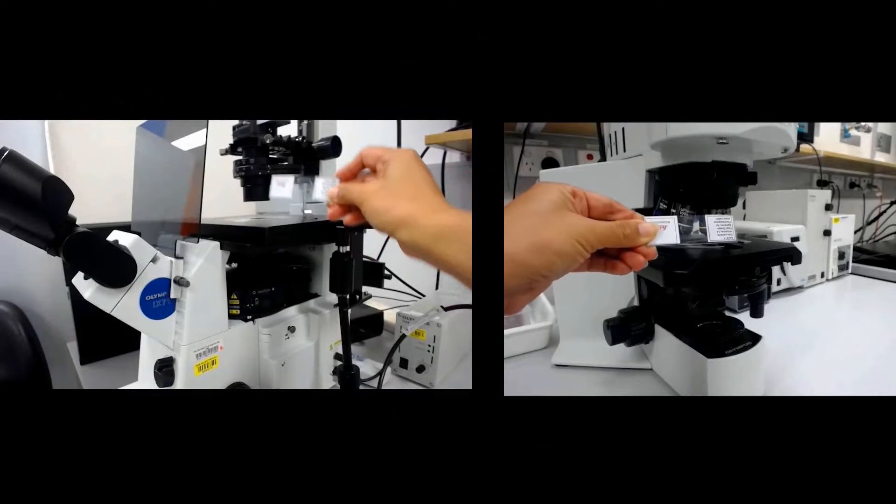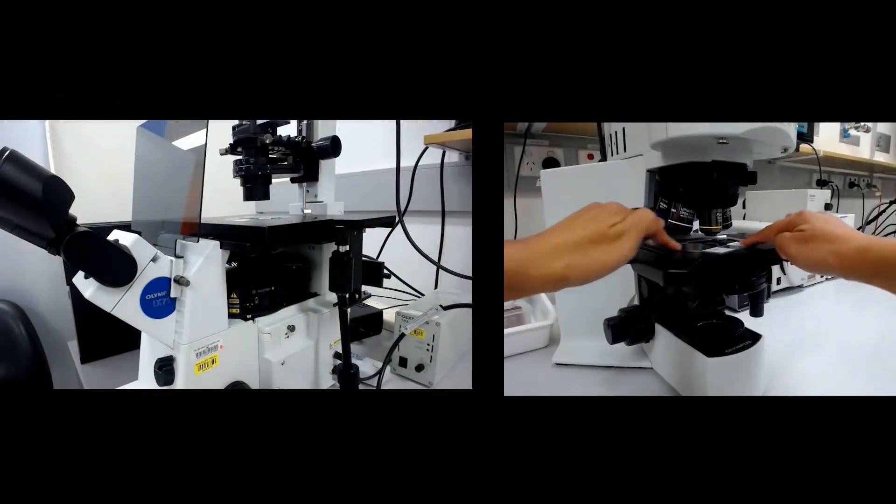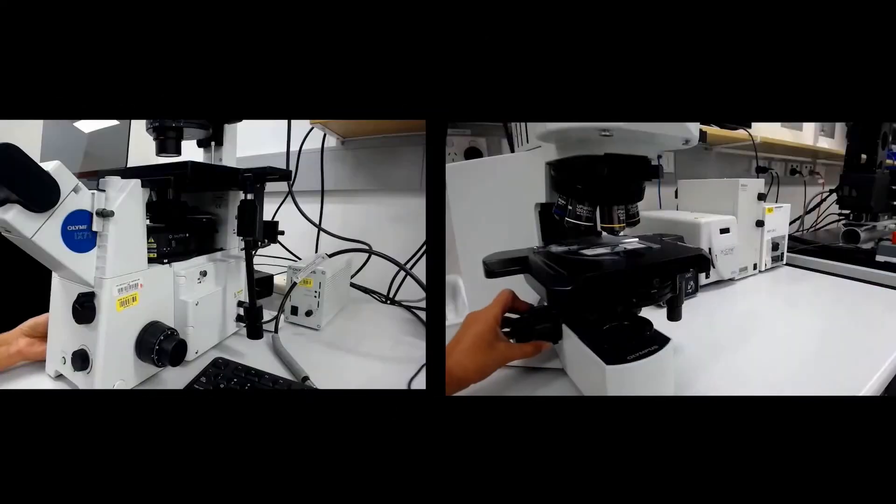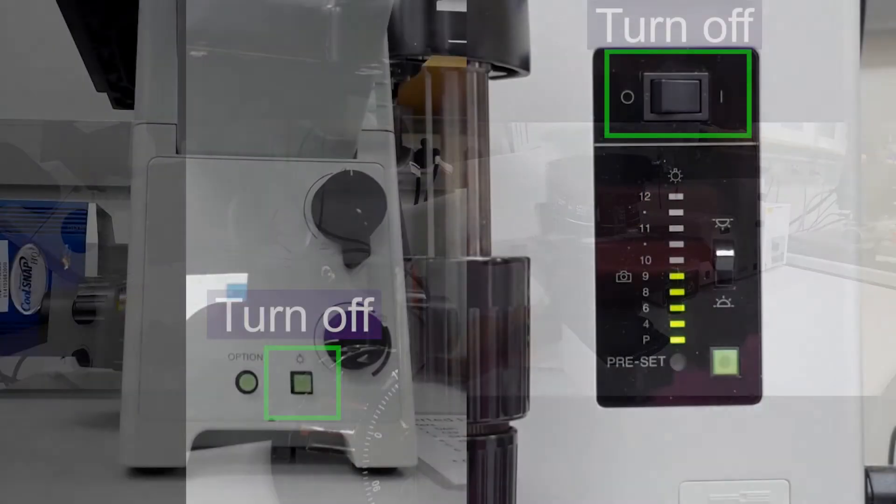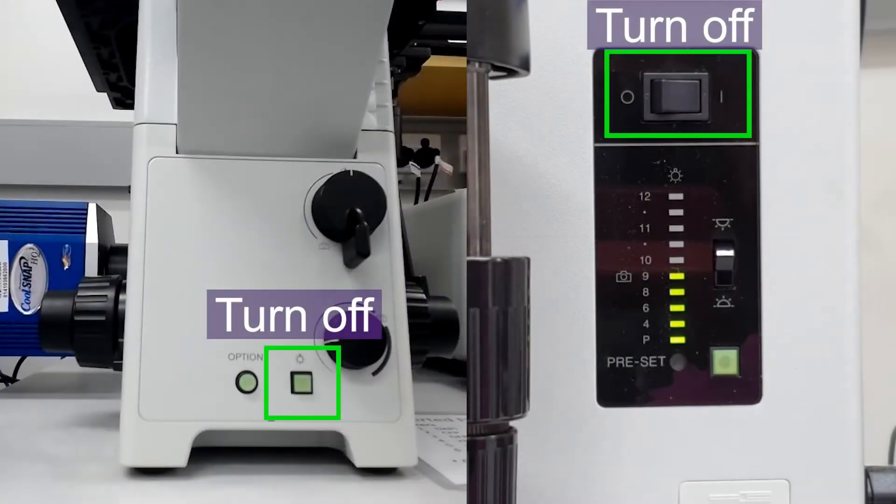Mount your sample on the microscope with the coverslip facing the objective and focus on the sample. Make sure to turn the bright field light off.